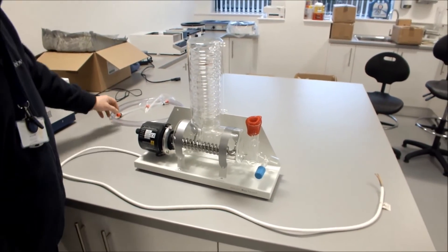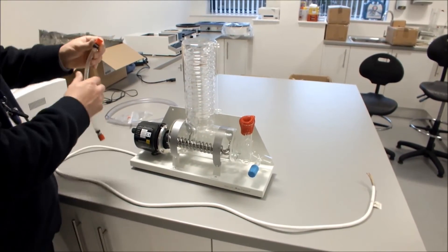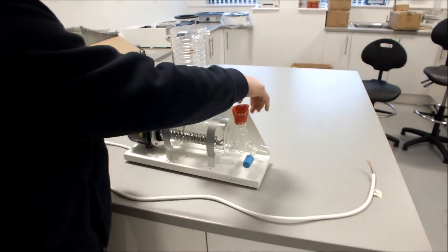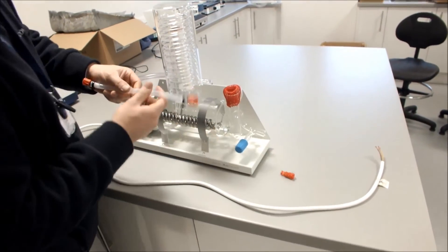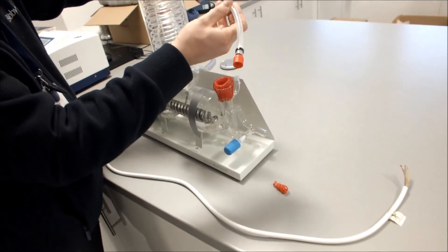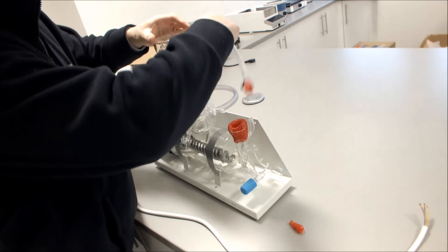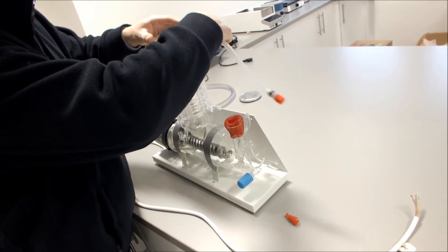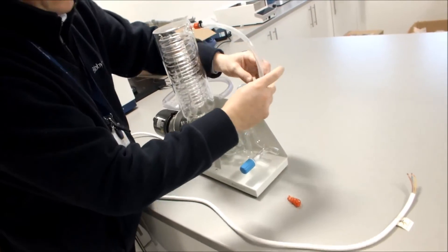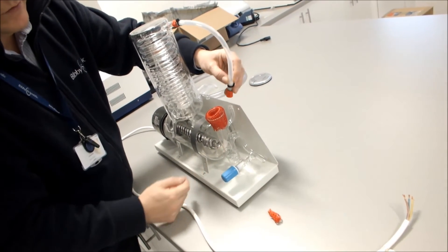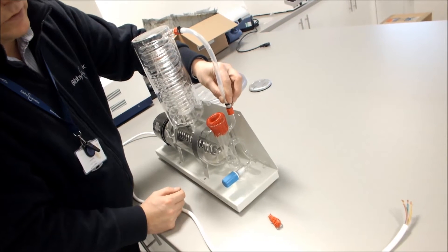When we've done that, we then take our 8mm tubing with the two connectors. We then connect this to the outlet, which is the top of the condenser. We then connect it to the connector sidearm of the water constant level control.